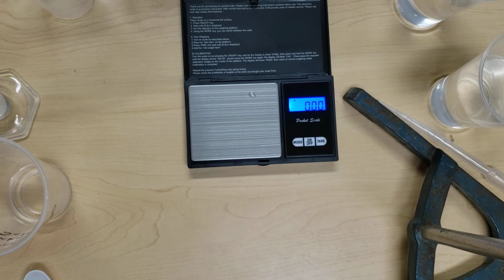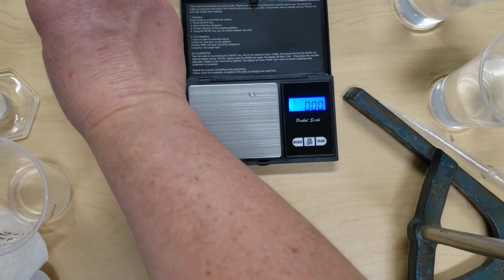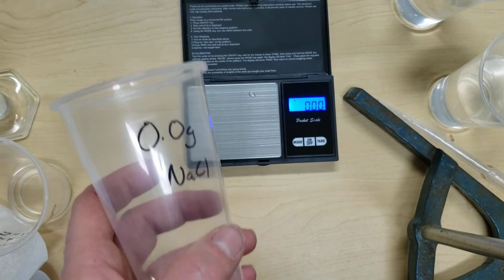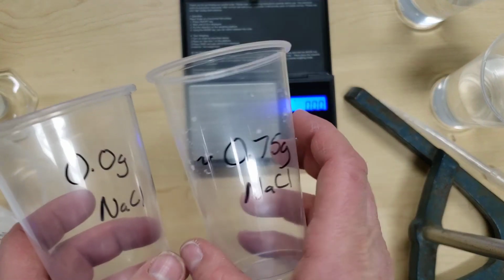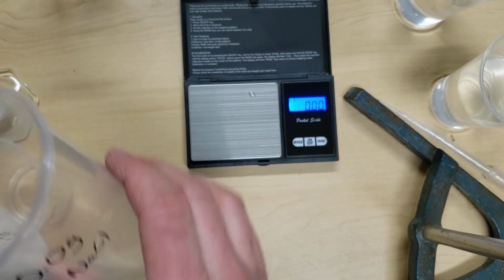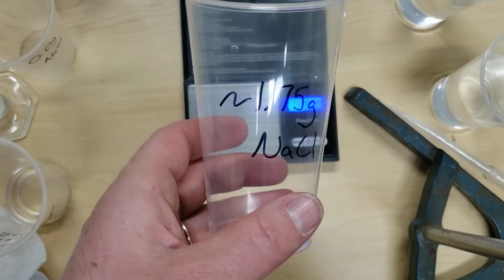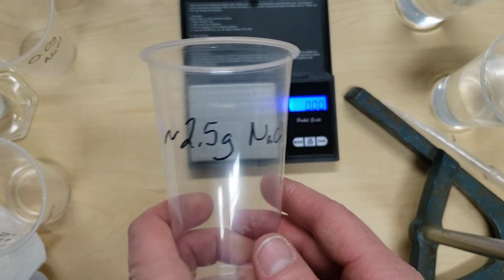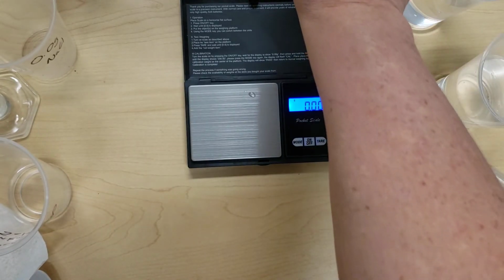For step B, we are going to make the solutions for our calibration curve. Okay. So we want to start, and again, it's a good idea to label cups. We're going to make a solution that has 0 grams of sodium chloride. We're going to make solutions that have 0.75 grams, about 1.75 grams, and about 2.5 grams of sodium chloride.